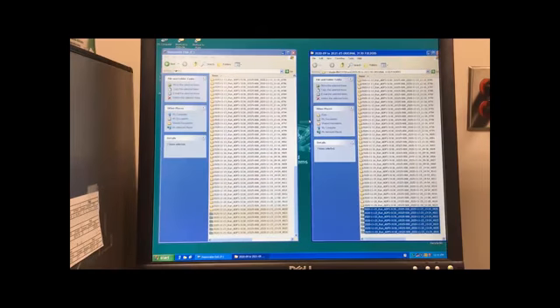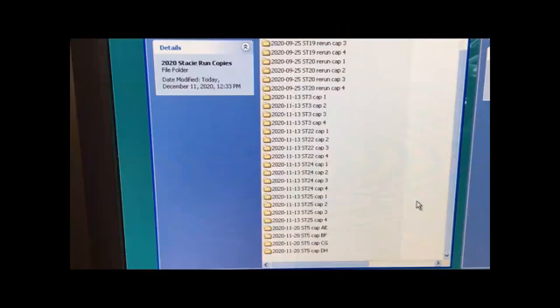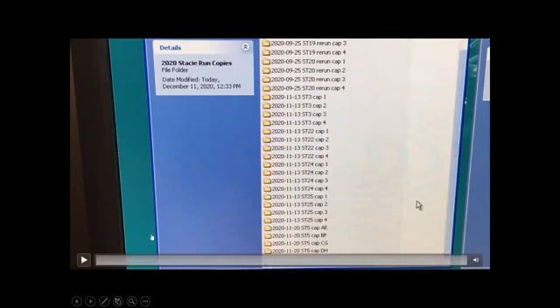Okay, so you think, oh, that's pretty easy, and you guys can probably figure that out as long as you know where you're going. But now is where it gets tricky.